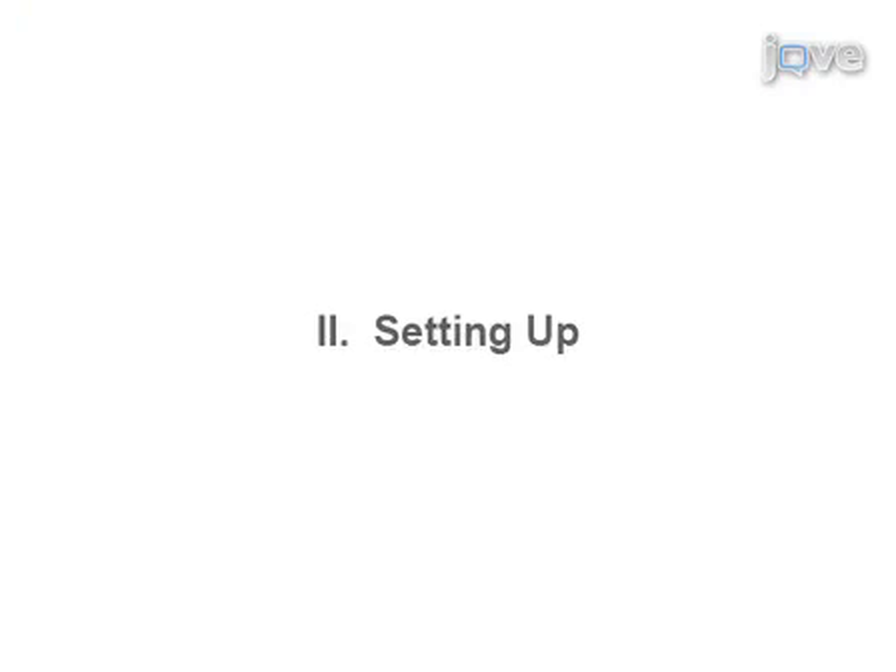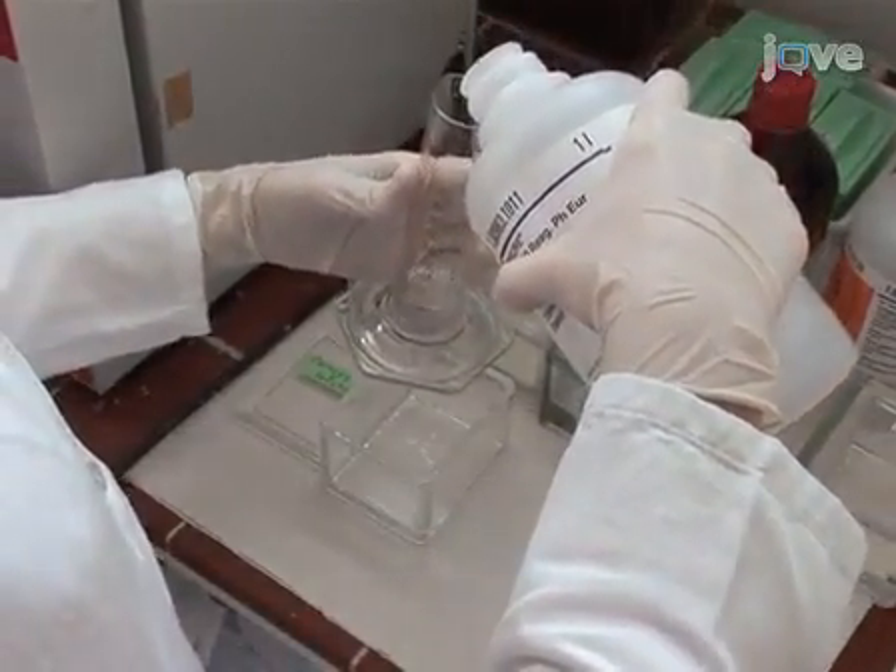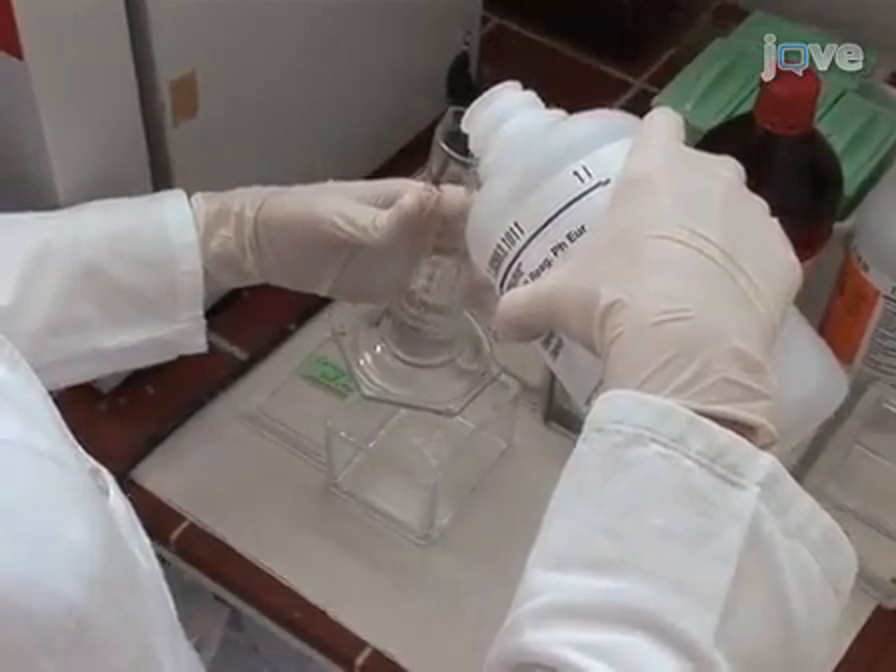The technique will be demonstrated today by Maria Kucharinko. Keep all solutions for submerging collars in glass staining jars. To start, prepare fresh Carnoy's fixative by combining absolute ethanol, chloroform, and glacial acetic acid.